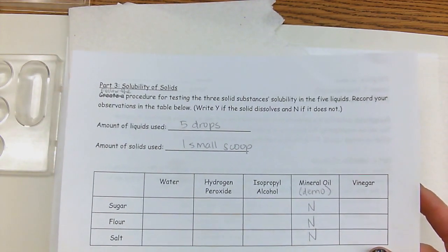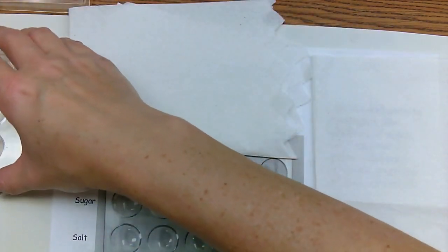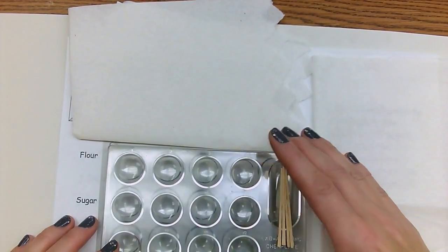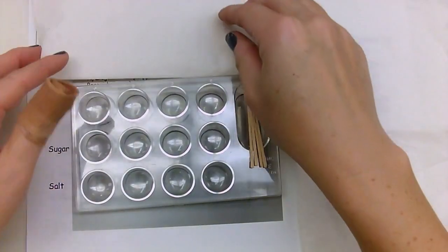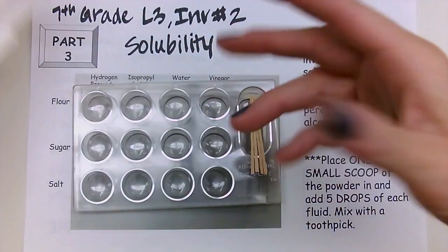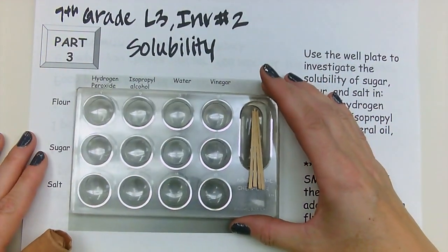All right, so what we're gonna do next is set up the rest of them so that you guys can do that. So this is what your well plate looks like, okay? And your well plate is going to have all of the circles filled up, okay? All of the wells.